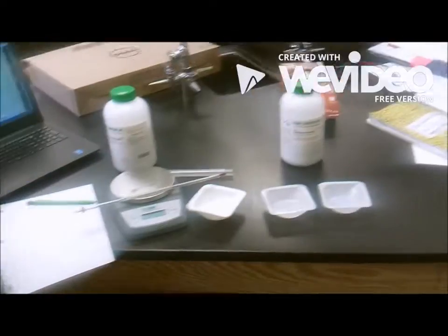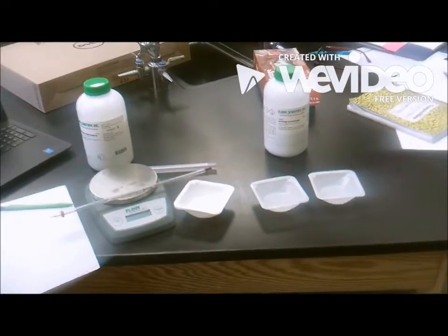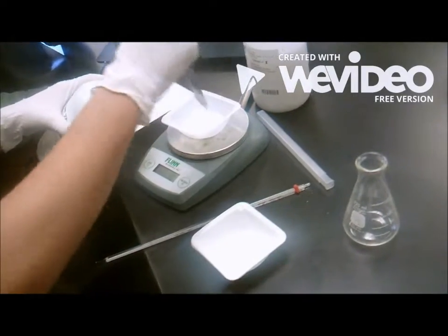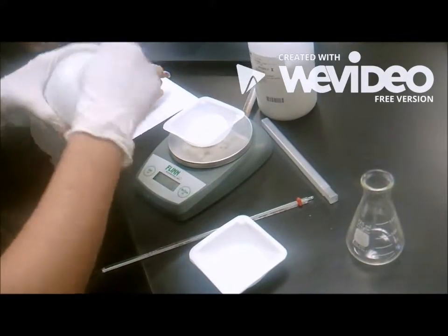of its surroundings. In my experiment, I mixed two substances, ammonium thiocyanate and barium hydroxide octahydrate. After the two mix, they create an endothermic reaction.